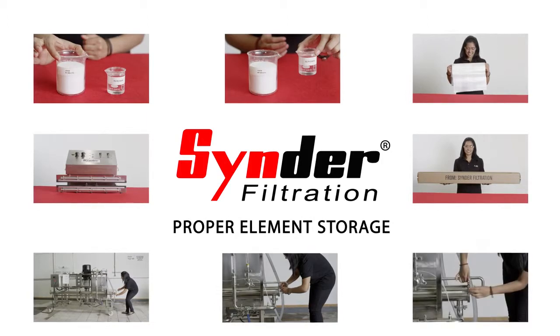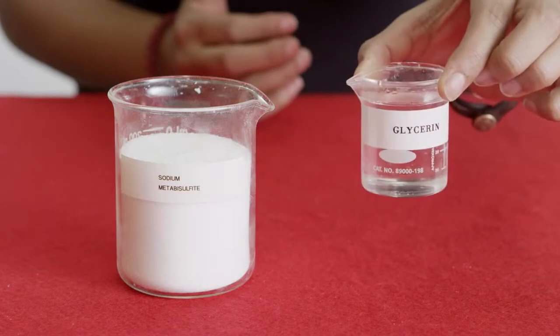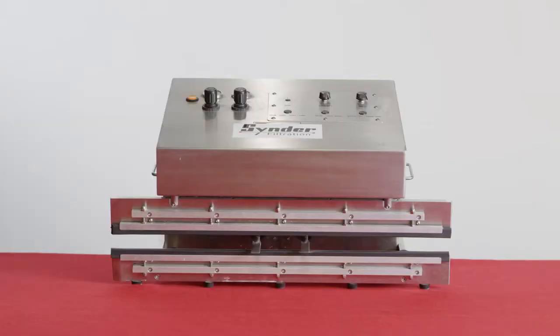Before you begin, you should have the following tools: sodium metabisulfite and/or glycerin, poly bags, and a vacuum heat sealer.